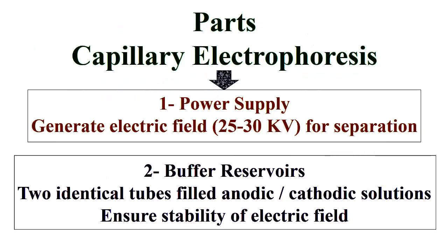Continuously, capillary electrophoresis has a power supply to generate the electrical field for separation, and buffer reservoirs, which are two identical tubes filled with anodic and cathodic solution to ensure stability of the electric field.